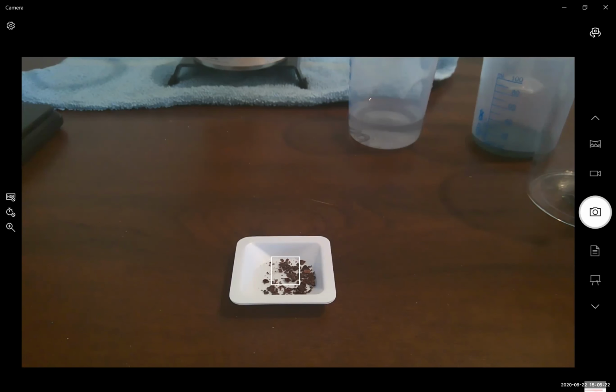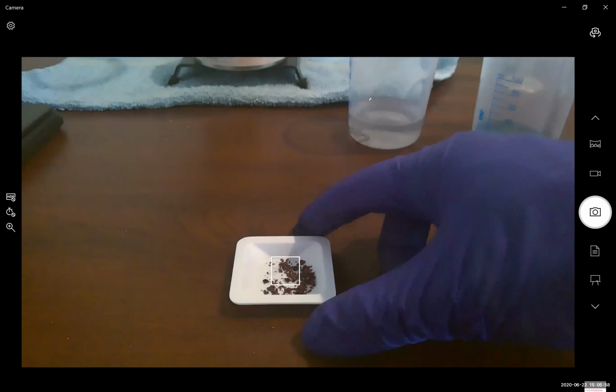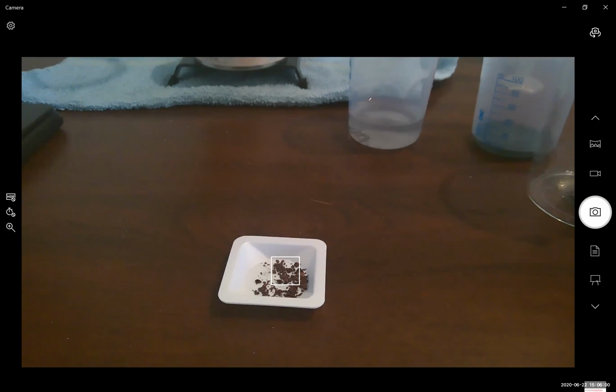For the weight, looking at the recording, would someone from the class like to provide a measurement that they took for the mass of the aluminum plate and the copper? Would someone from the class like to provide a measurement? Oh, for the copper itself, the balance couldn't detect it. It's not accurate enough to detect the mass. I can try recalibrating it, but it's not picking it up. So putting it on the weigh boat is just to take the photo of the copper.